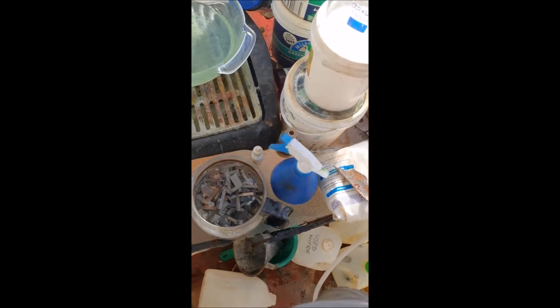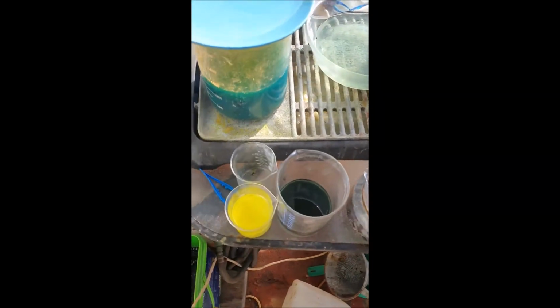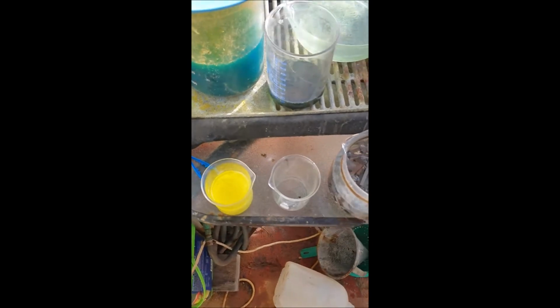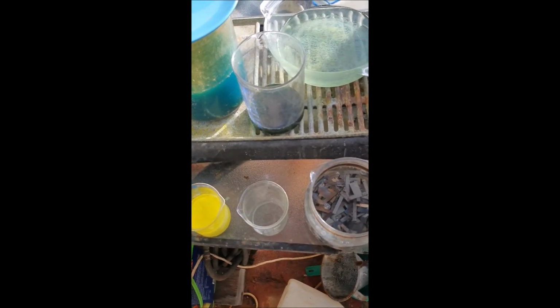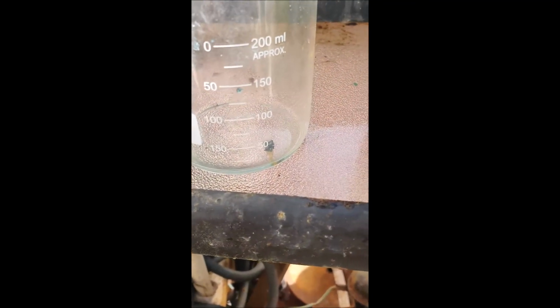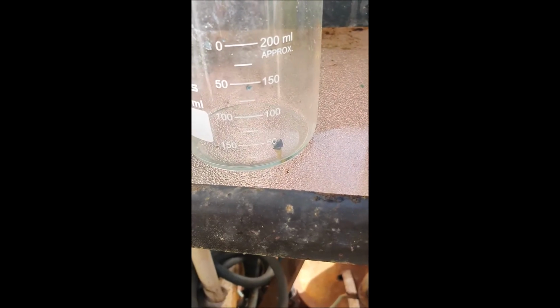So 3 times the amount, so now I want 75 mils of sulfuric acid. I'll get this out of my way for now. There's my little beaker there, and my sulfuric acid. Alright, so it's hard to see where 75 mils would be on this. Come on, zoom in. I know what I'll do. I'll touch that. Too far. There, so okay, on the right hand side it'd be between the 50 and 100, I'm guessing.